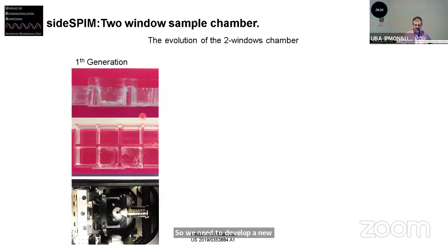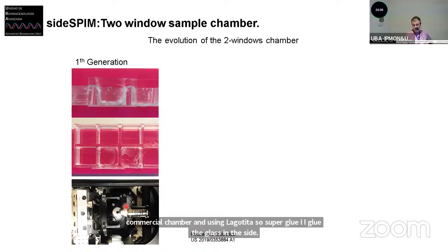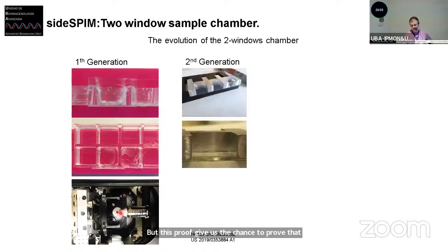This is the first attempt, when Nick came to my office one day and we ran to the machine shop. I just opened a wall in a commercial chamber and, using La Gotita, super glue, I glued the glass on the side. This gave us the chance to prove that this may work, and we took this seriously. We went to the machine shop with Sasha, and Sasha helped us build the first, more formal chamber. You can see this is an aluminium chamber where we glued the glass in the bottom and then on the laterals. And this is the resin, one millimeter high.